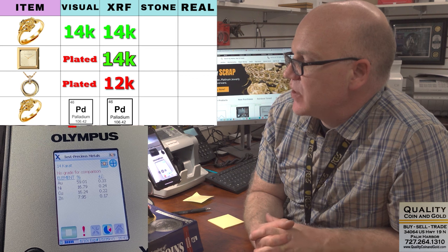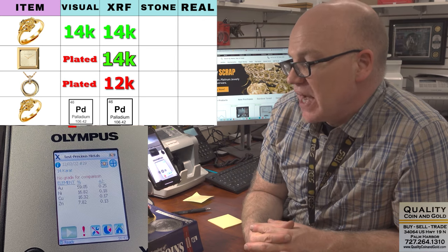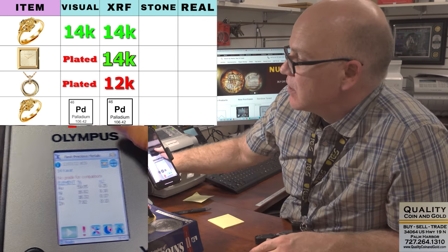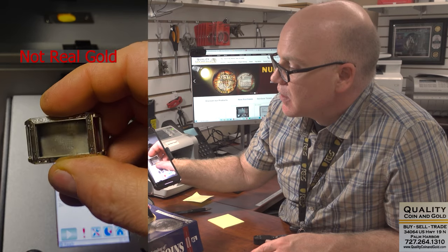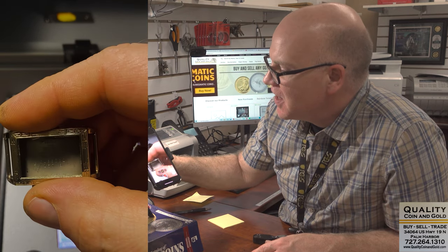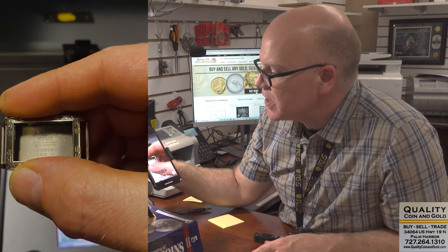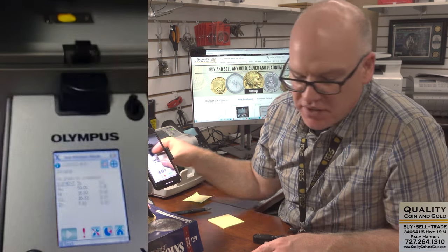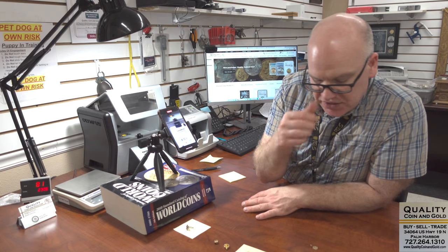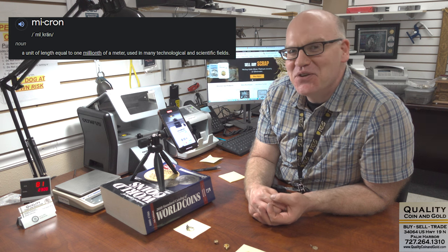This is where XRF machines fail — we can see that it's giving us a solid 14 karat reading, but it's not 14 karat; it's 14 karat gold fill. The reason it fooled the machine is the machine only goes a couple microns deep at best. A micron is a very, very small unit of measurement — it's just plating. So XRF machines are great tools, but they don't read through heavy plating or gold fill.